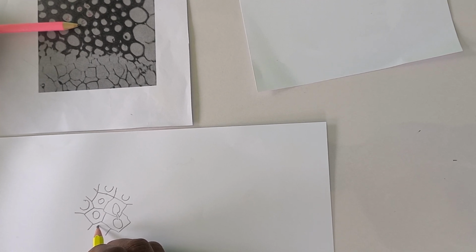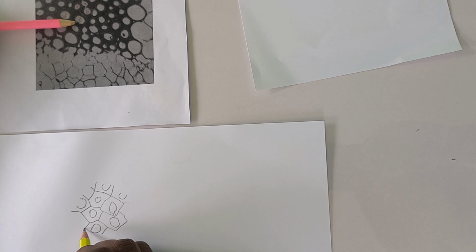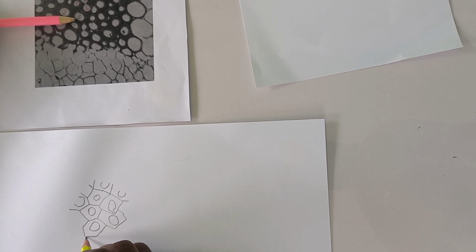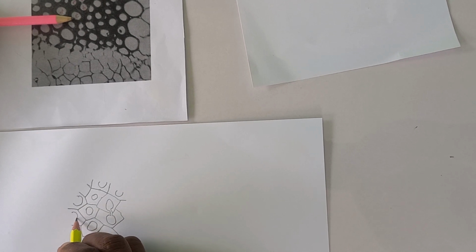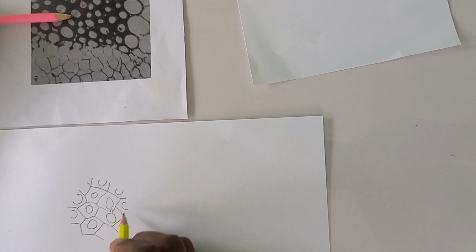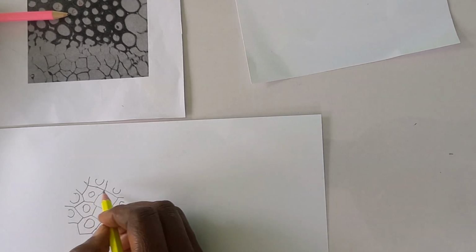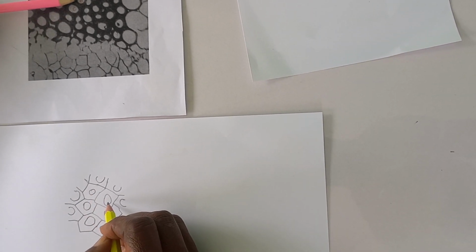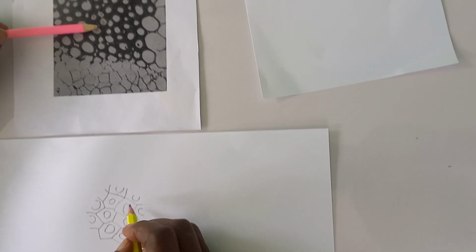This is C here. So we're interested in this lumen and this lumen with the pit.